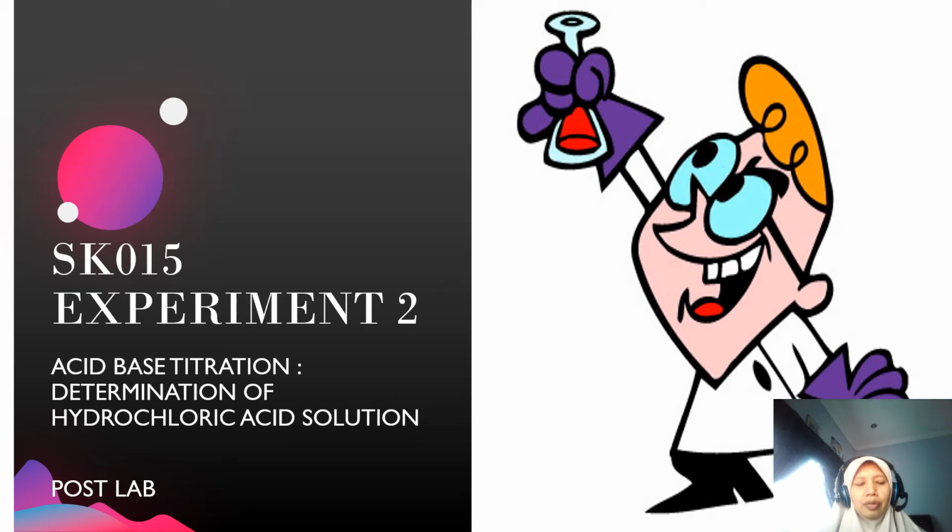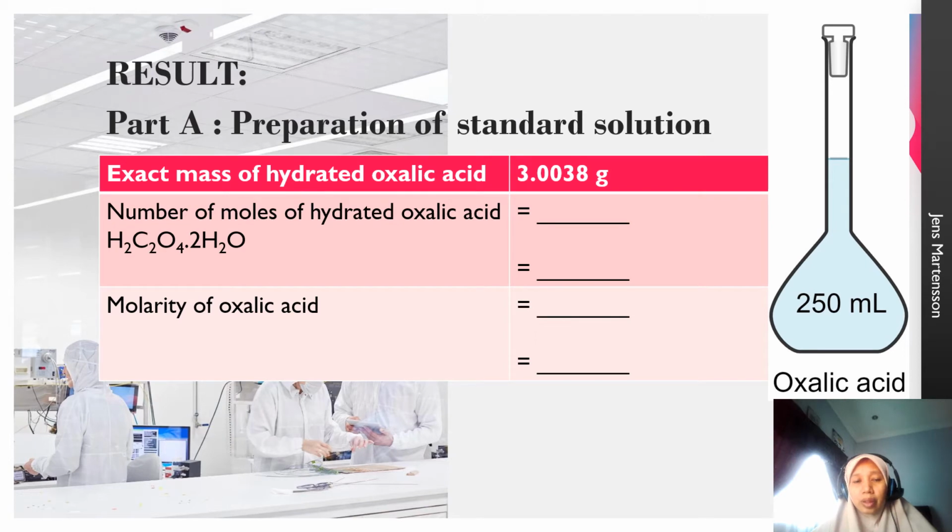This is the recorded version of the post-lab for SK015 experiment 2, which is on acid-base titration, in which you have to determine finally the hydrochloric acid solution. Okay, let's begin with part A, preparation of standard solution of oxalic acid.